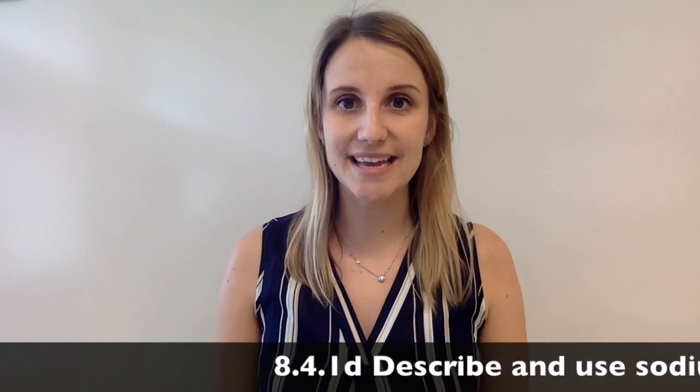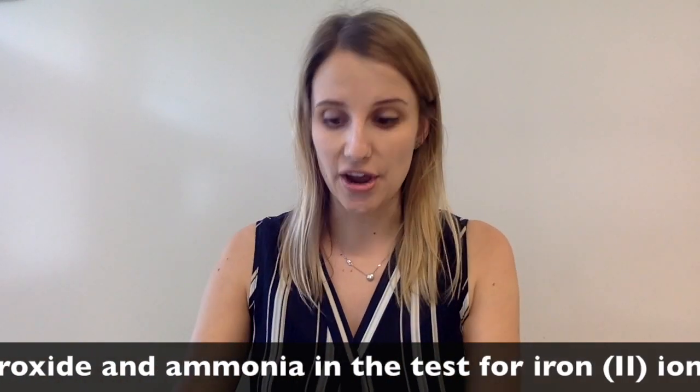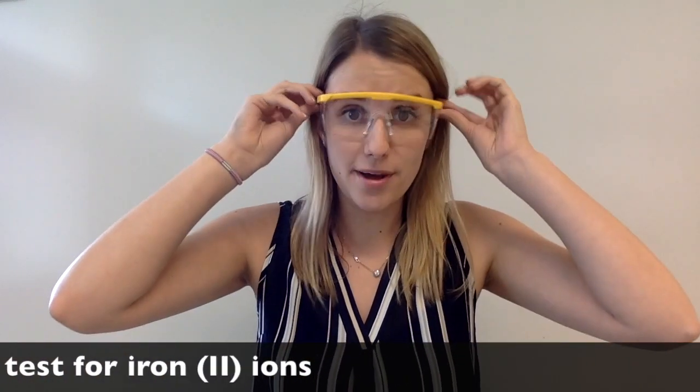Hi guys, this video is all about the test for iron 2 ions. So we're going to crack on with the experiment first to see what the observations are, and then we're going to talk about the reactions that are actually happening.